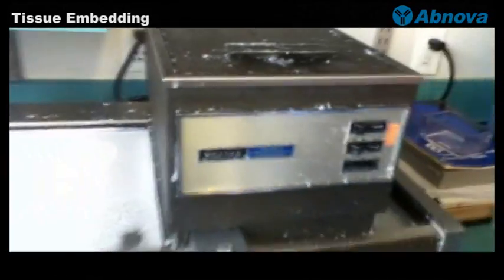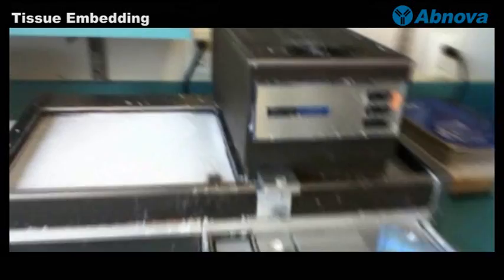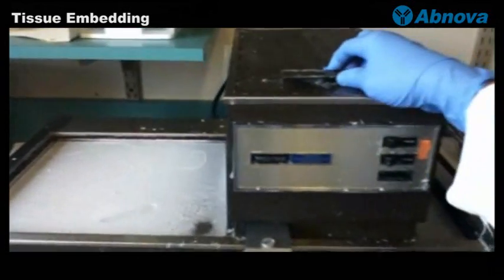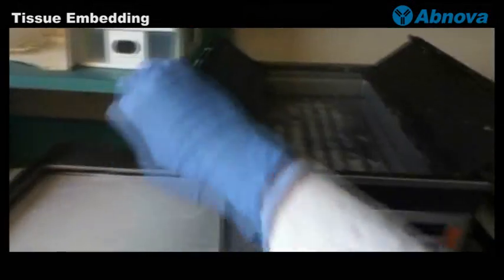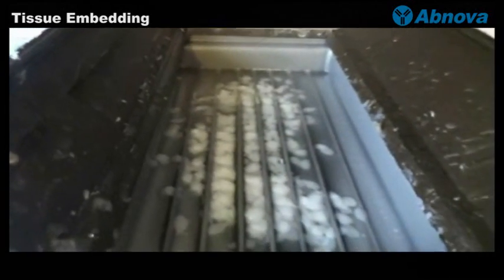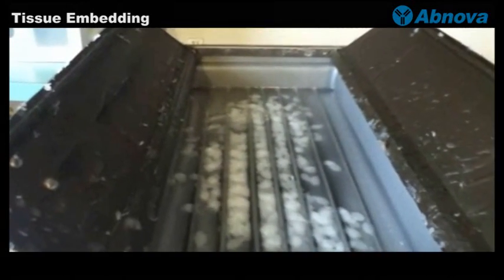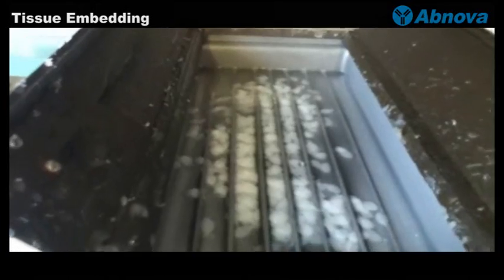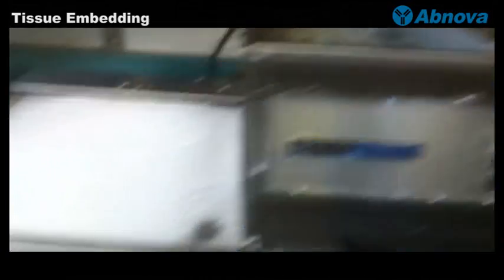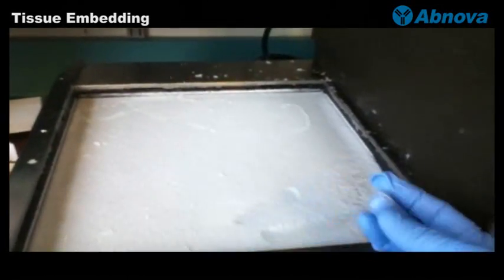We have to turn on the embedding machine so that the paraffin inside will start melting and the cold surface is cold enough.